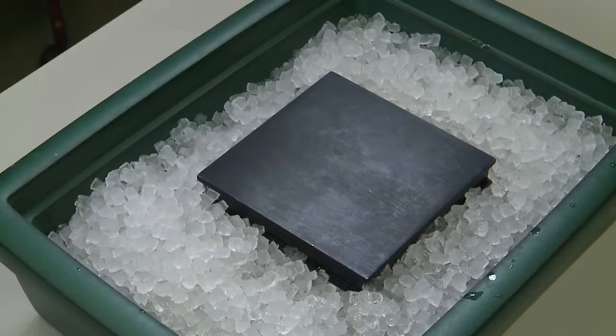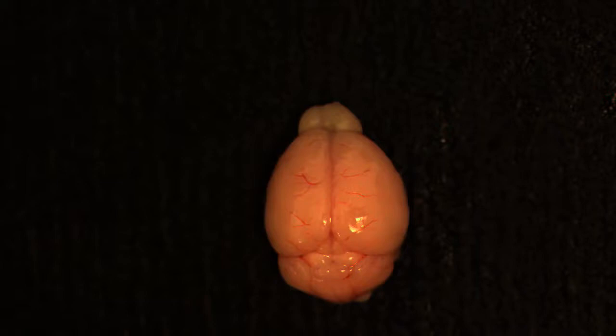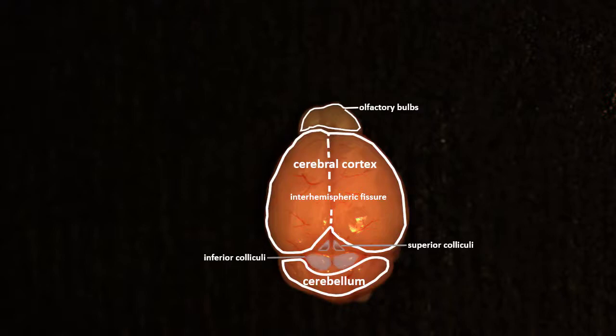After sacrificing the mouse by cervical dislocation and extracting the brain from the skull, rinse it in cold PBS to remove excess blood. Then place the brain with the ventral side facing the cold plate. To prevent the brain from sliding too much, you may add some blotting paper moistened with PBS on the cold dissection surface beforehand.